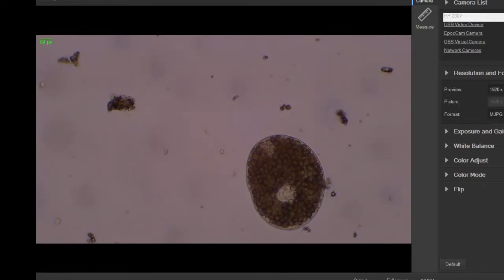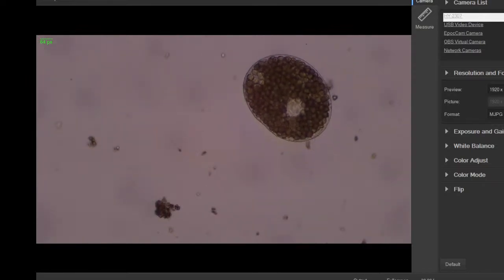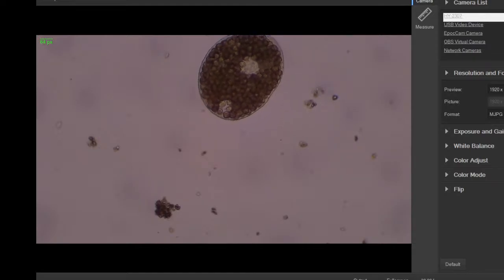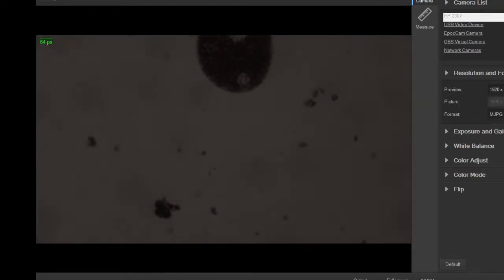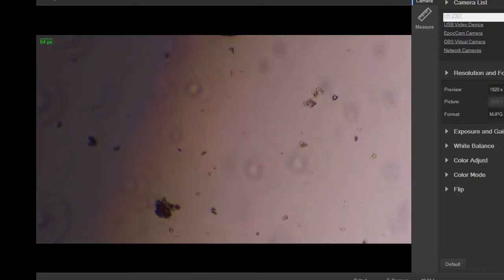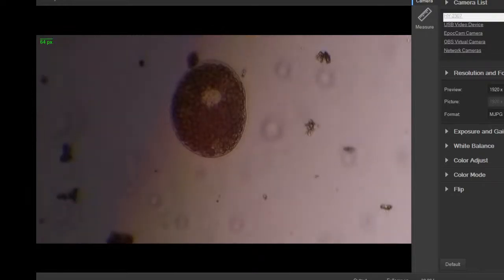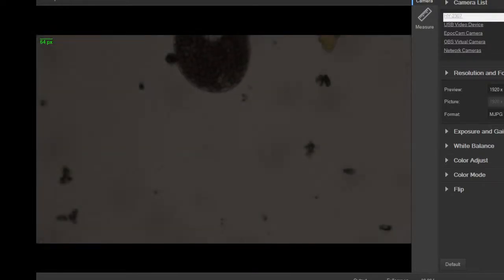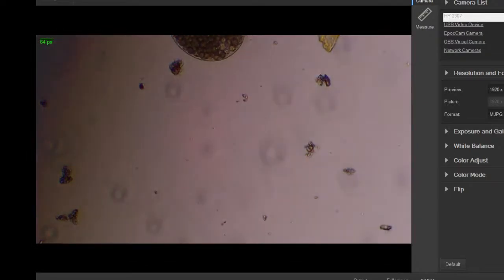It's a very cool one now. Very nice. Needs more light though. Let me change the light levels here a bit. Give a little bit of dark field, might make it interesting, or at least oblique lighting.